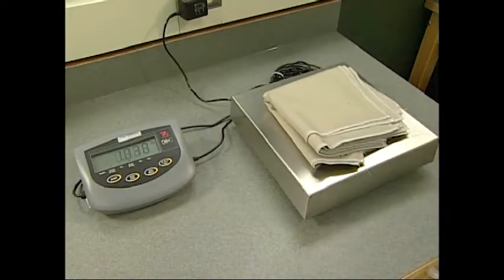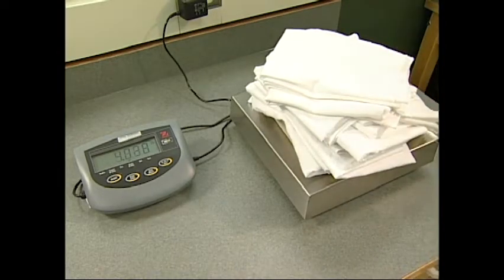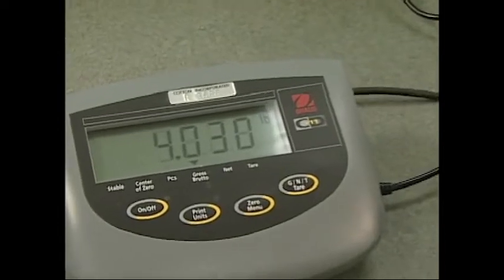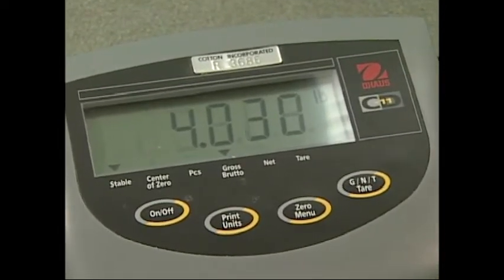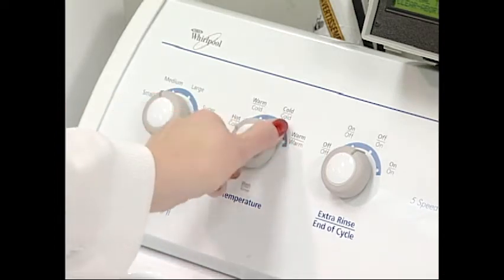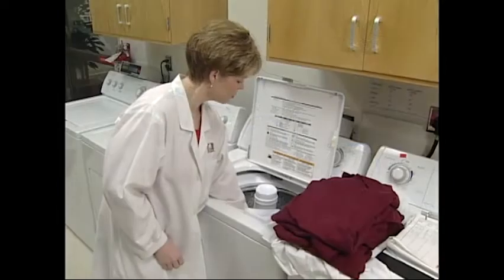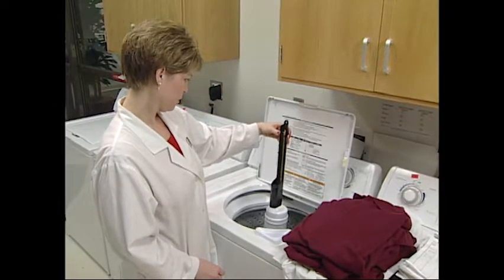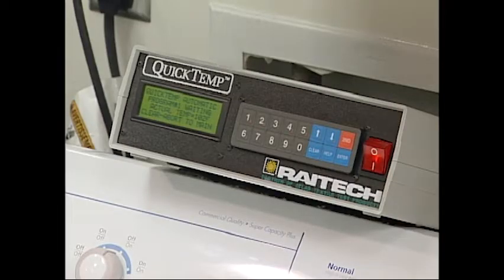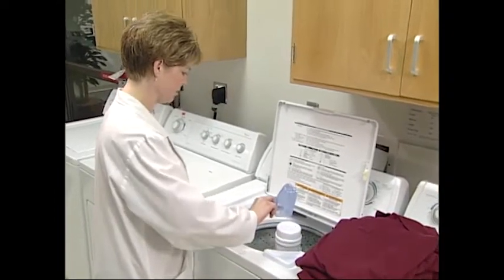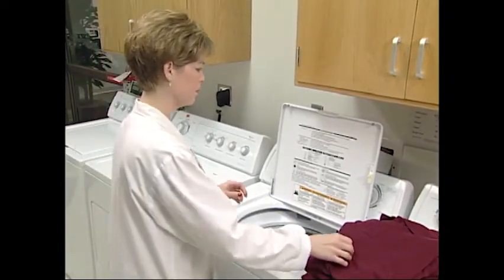The test load size should consist of test specimens and enough ballast pieces to make a 4.0 pound dry weight load. Woven and knitted specimens should be washed separately from each other, with exceptions for garments containing panels of both woven and knitted fabrics. Set the water temperature control to the appropriate setting for the wash and rinse temperatures, and check the wash temperature with a dip thermometer. Fill the washer to the medium water level setting, which achieves an 18.0 gallon level.